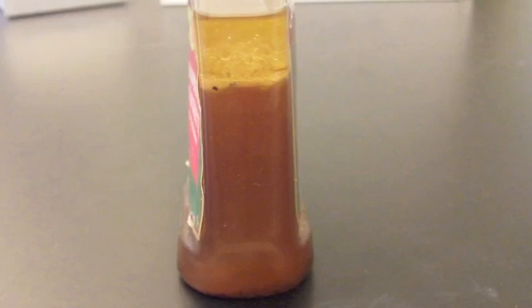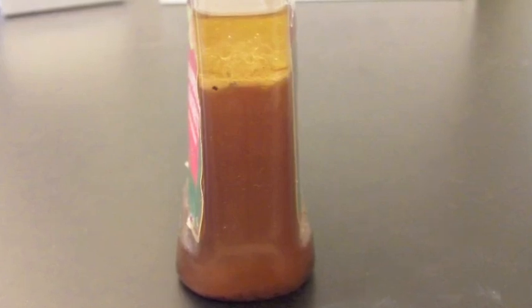Usually one of those phases is going to be aqueous, water-based, and the other one will be organic. Nearly always they'll have different densities, and so if you shake them up and let them stand, they will separate into two phases, just like oil and vinegar salad dressing.